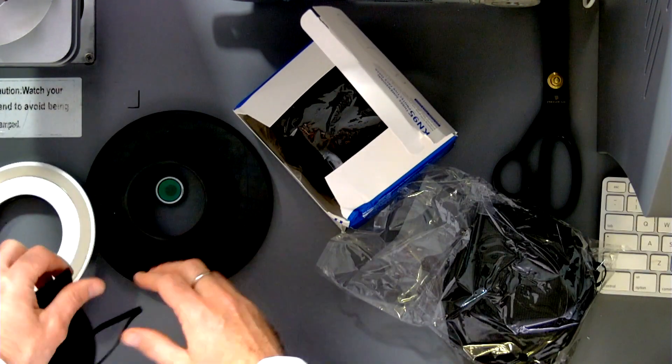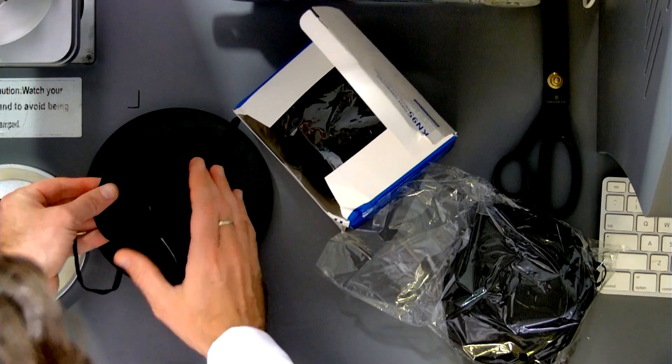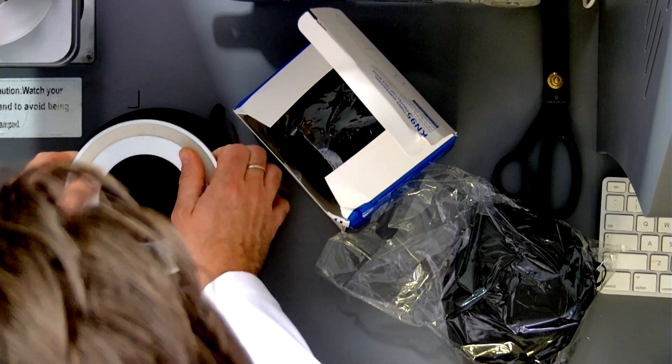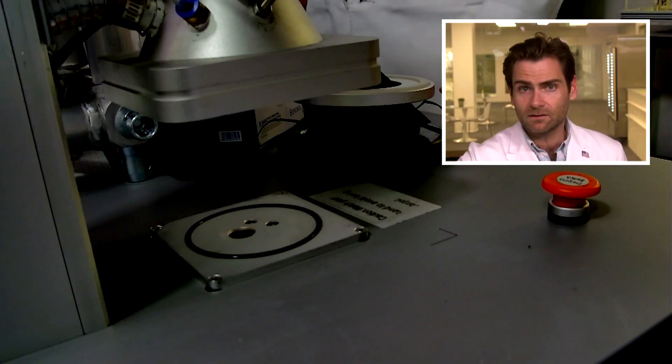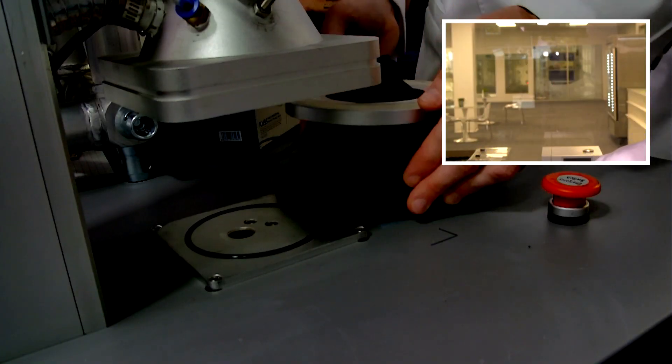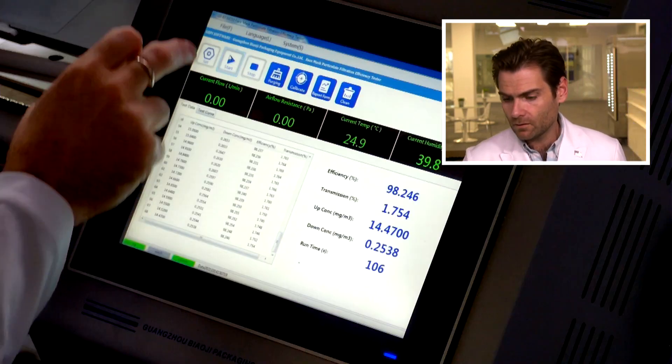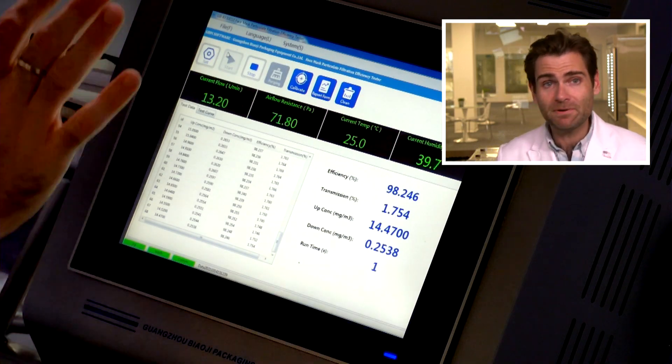These are claiming to be KN95s. I can tell you already that they are not, and I'll tell you about that in a sec. Let's clamp it on and let it rip. This is a PFE machine — a particulate filtration efficiency machine. This does the N95 test, and it will tell you if this mask will pass the KN95 standard.